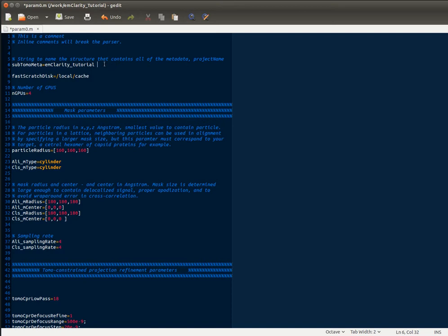So if I were to add a comment here, that would actually break the parser, so don't do that. Additionally, you don't want any spaces between the assignment operator, the equal sign, and the variable you're assigning. Third note is that there's only a few of these parameters that can be specified as strings, and those are the ones specified as strings to start. So now we'll go through the parameters one by one and explain what they mean.